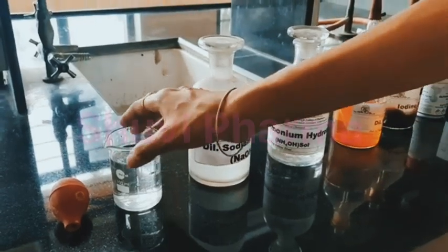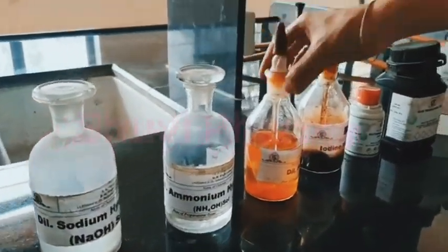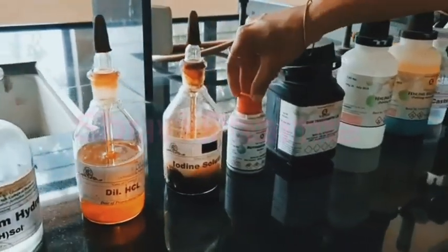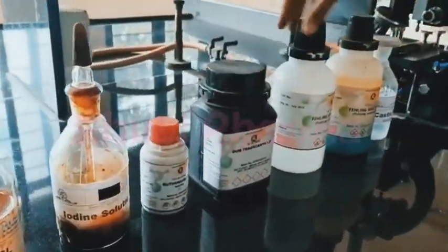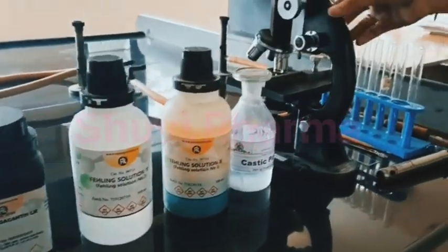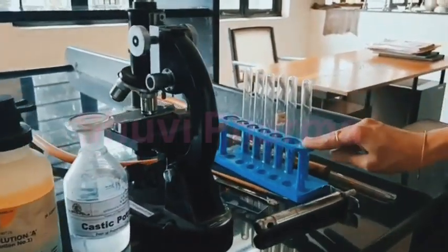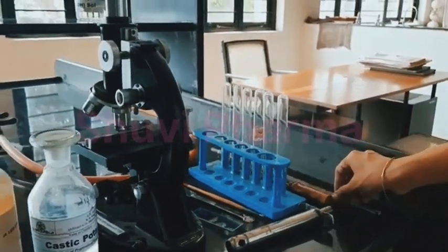For the practical we require water, dilute sodium hydroxide solution, ammonium hydroxide solution, dilute HCl, iodine solution, ruthenium red, the powder that is gum tragacanth, Fehling's solution B, Fehling's solution A, and caustic potash. A microscope is also required as an apparatus. Then slide, spatula, brush, test tube holder, and pipettes.